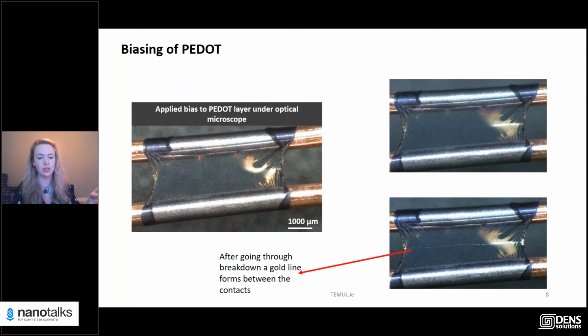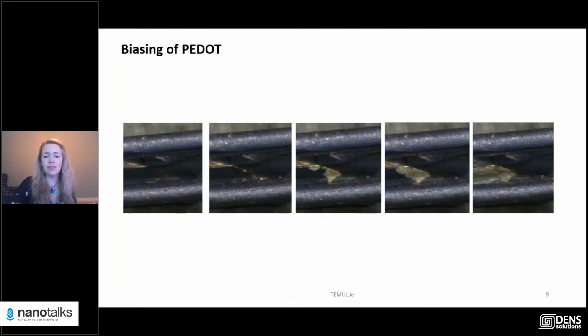And in this case, he was using, I believe, copper wires. And so we thought, okay, that's really, really cool. What is happening there? And even if, let's say, you put down this PEDOT, the thin film of this polymer, even in lots of different ways, you always form this golden region. And just to bear in mind at the start, the material itself is what I call 2D. It easily adheres to any material, so it was easier to put this down on top of the contacts. There's no other sample preparation.